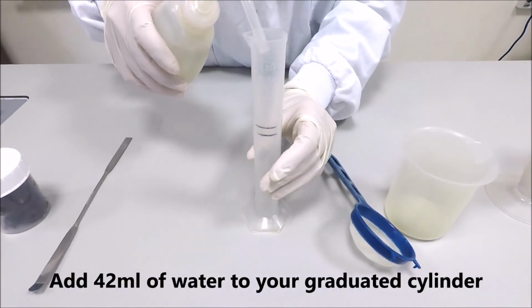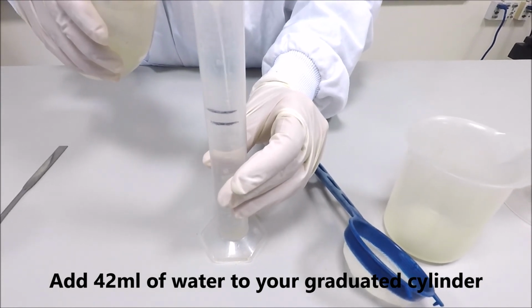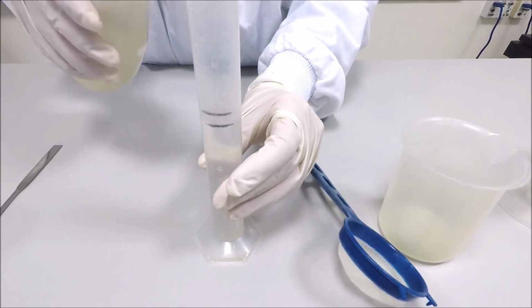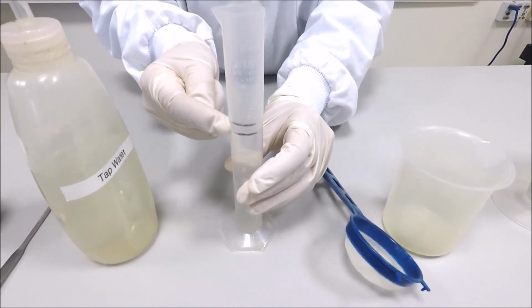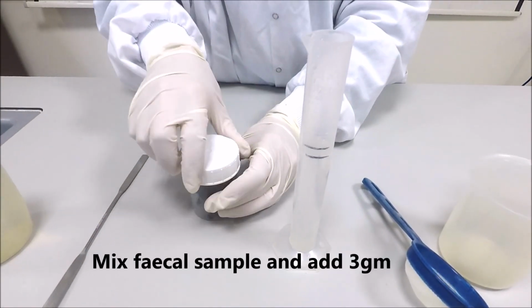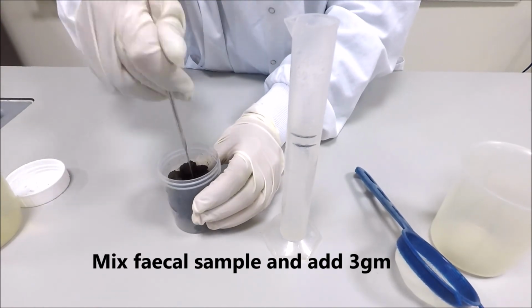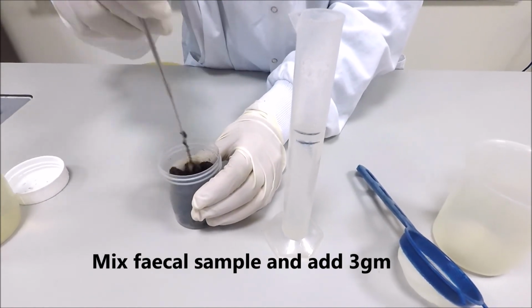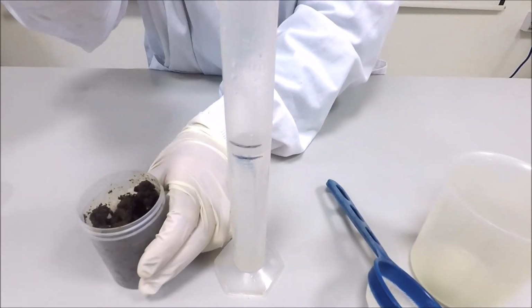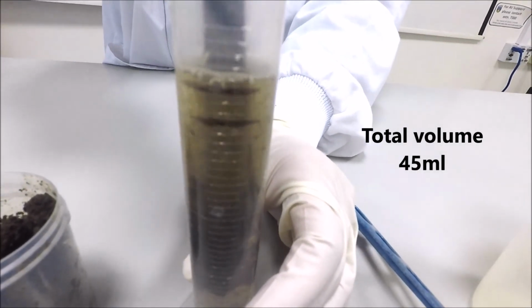Add 42 ml of water to your graduated cylinder to the first mark indicated. Taking your fecal sample, mix well and add 3 grams to your graduated cylinder. The total volume will now be 45 ml.